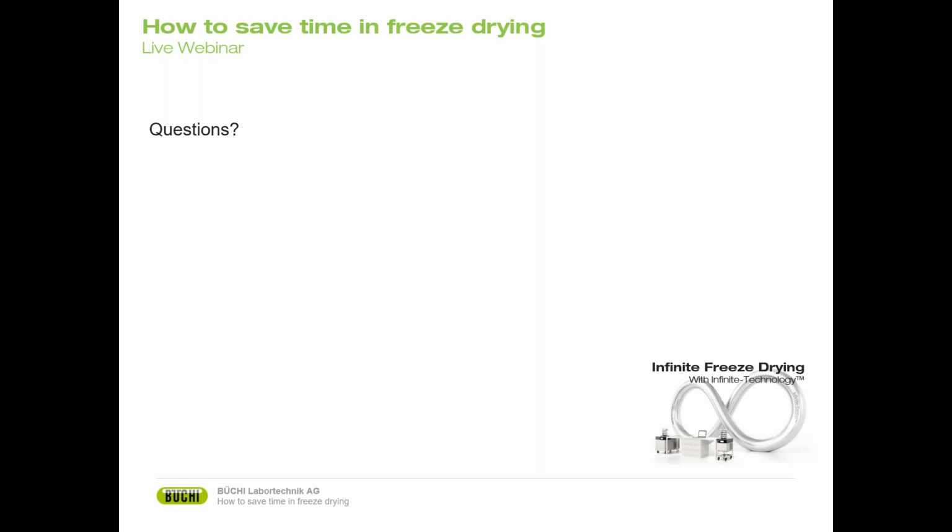But I think the pressure difference works equally well. And especially for this constant decrease, there is a sort of advantage when you just look at the pressure difference. Okay, thank you very much.